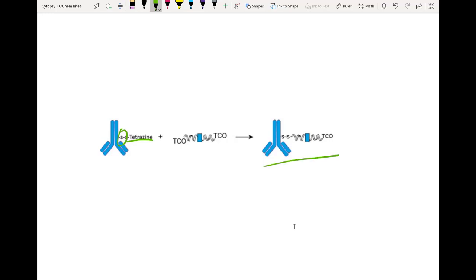You have to make sure that you quench any of this excess tetrazine that's inside these unconjugated antibodies because that might slowly react with the TCOs that are there on the conjugated antibodies over time. And to do this we simply use an excess of 3,6 diphenyl tetrazine for quenching. It's unlikely that this will cross-link antibodies but it's always good to be sure.